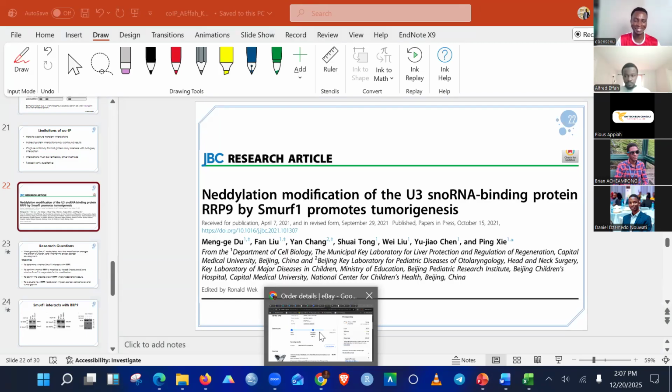So if it's unknown, we don't have any idea. So we do basic experiments. Let's say you are working with breast tissue and then you are seeing a new molecule. You have to do characterization. You have to characterize the protein that you've seen.